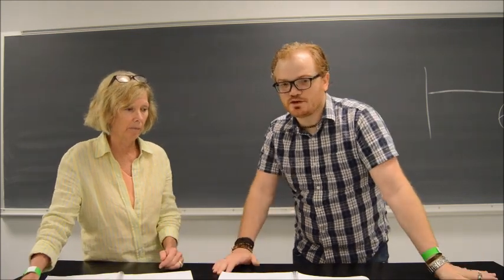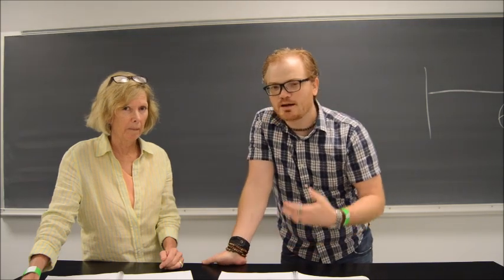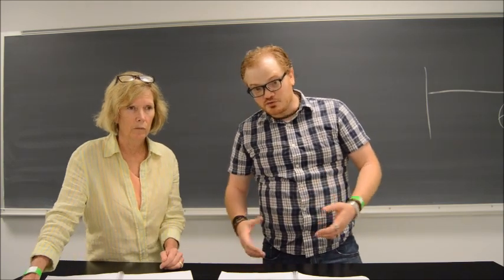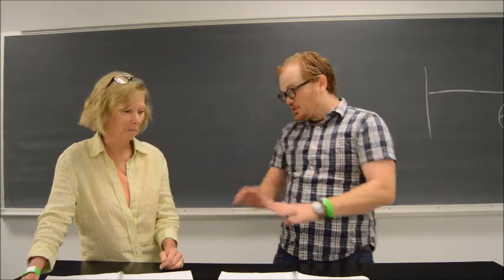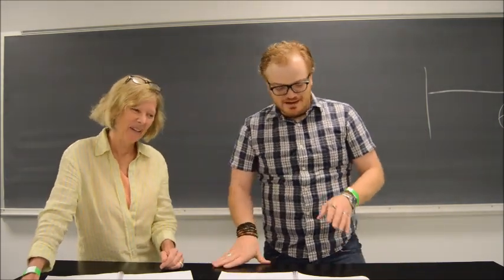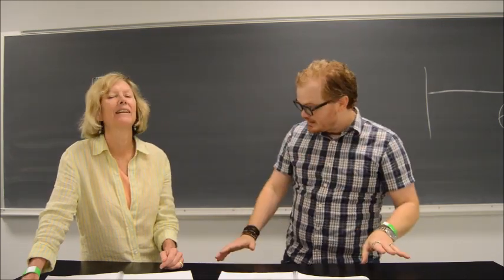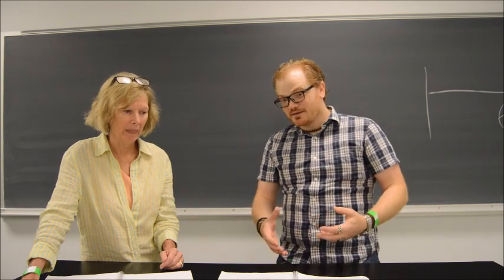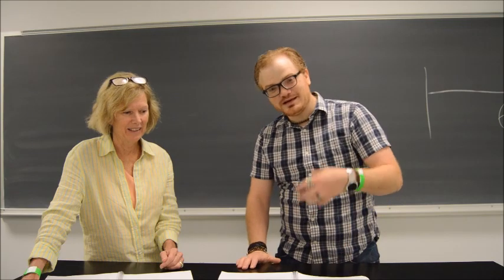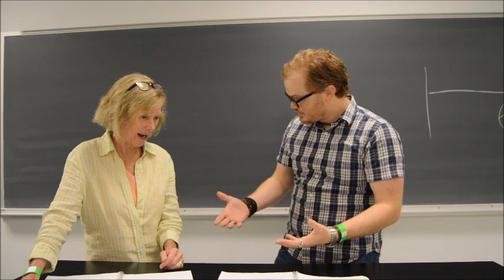So let's imagine we are looking for proteins. We have a solution and we're not sure if it has proteins in it or not, but we're going to find out by running one of these experiments. What we will do is we'll have a negative control, something like water, for instance, that we know has no protein in it. Absolutely. Or if it does have protein in it, we have major problems with our water supply. And then we will run a second experiment with something that we know for absolute certain has protein in it. All right? What we're doing there is we're having a negative control and a positive control. With our negative control being water, which we know has no proteins in it, our positive control being something that we know for certain has proteins in it.